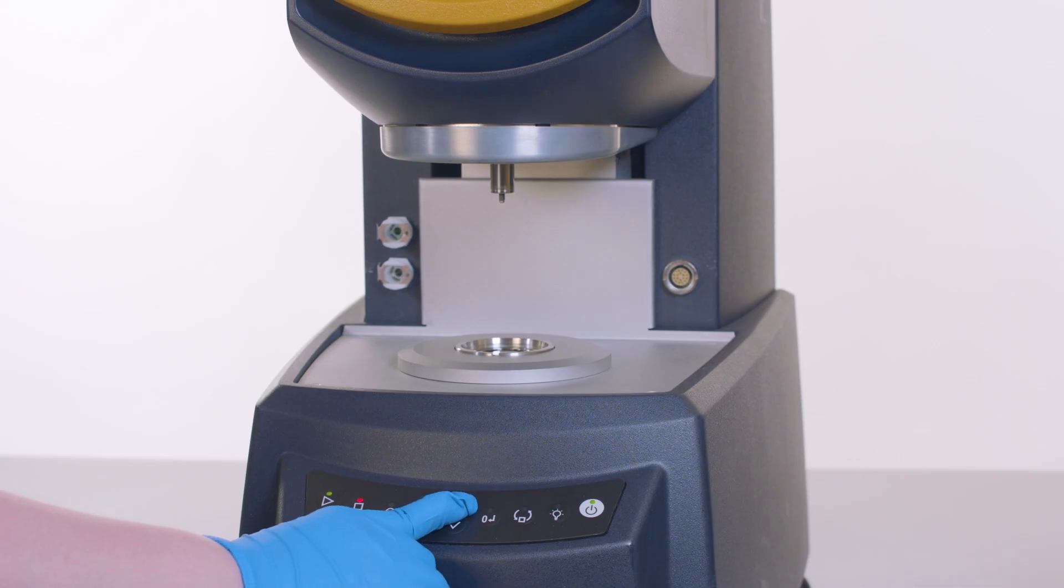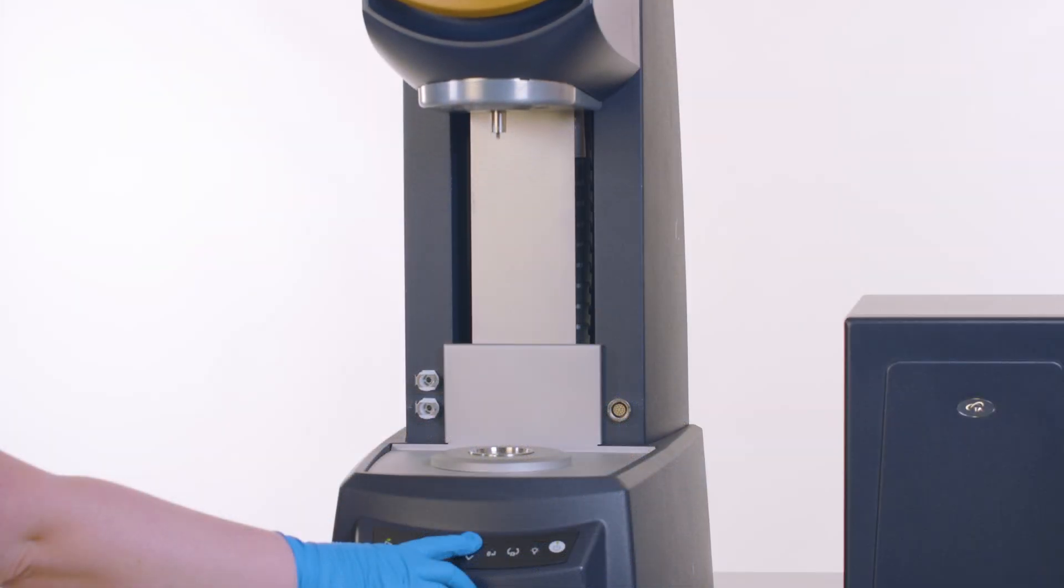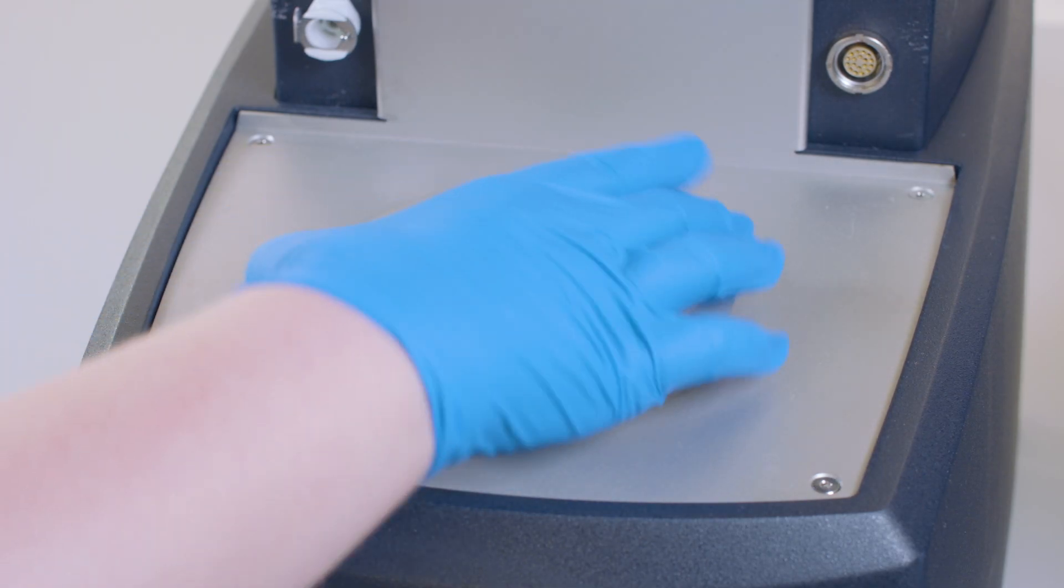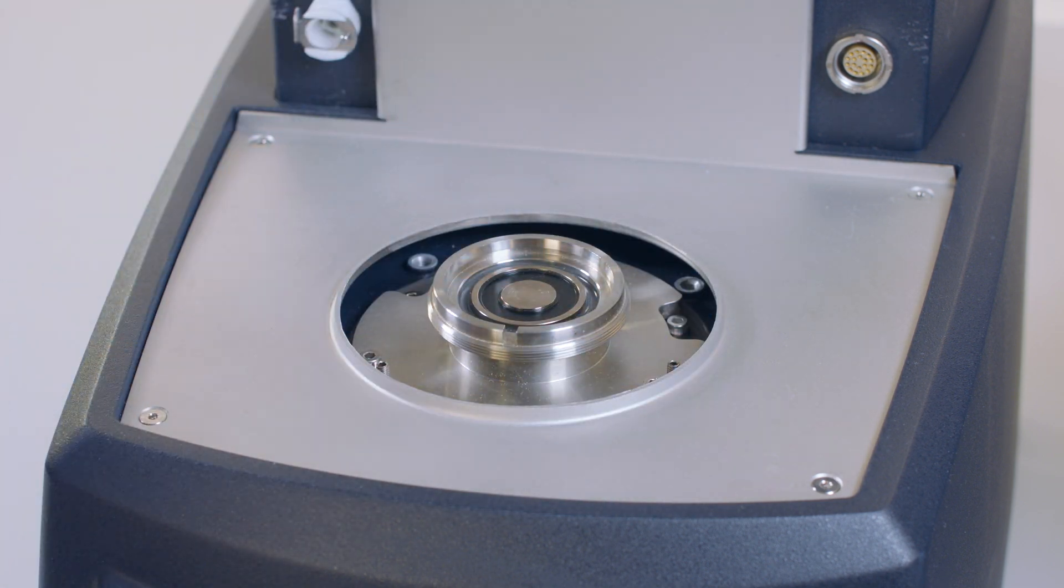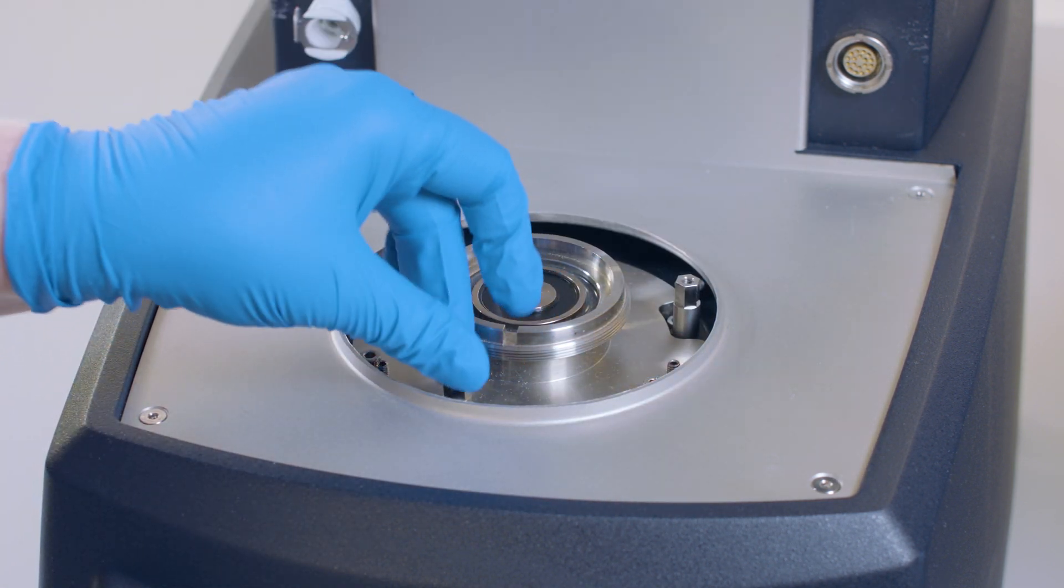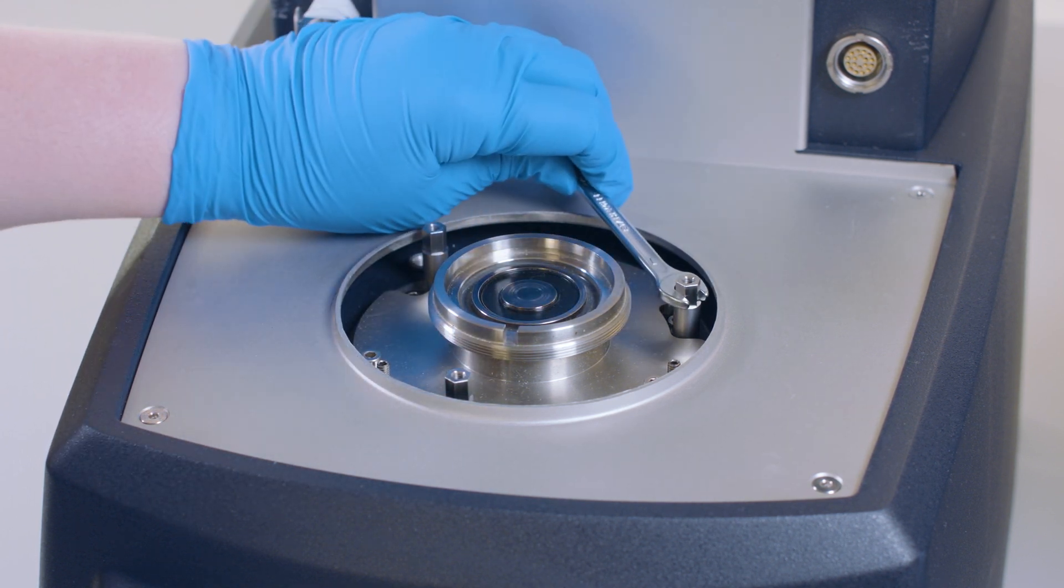To install the accessory on HR rheometers, raise the head to the maximum height. Unscrew the bottom cover and set aside. Screw the three support stands into the empty holes in the base. Gently tighten with the provided wrench.